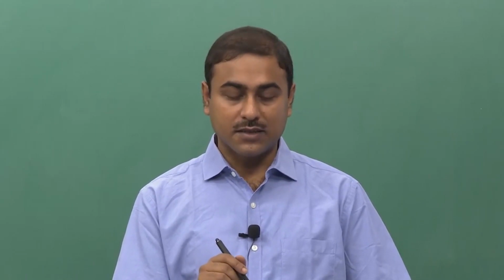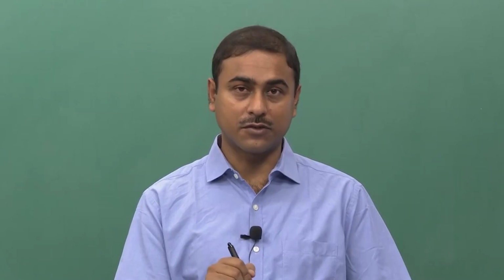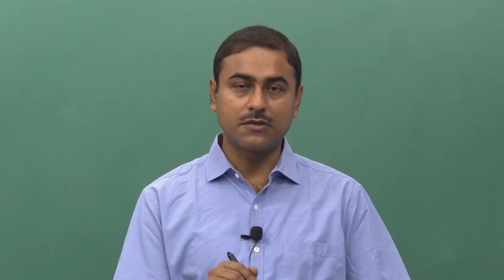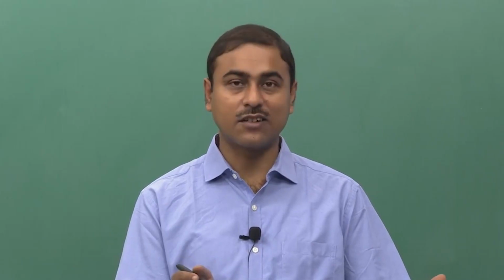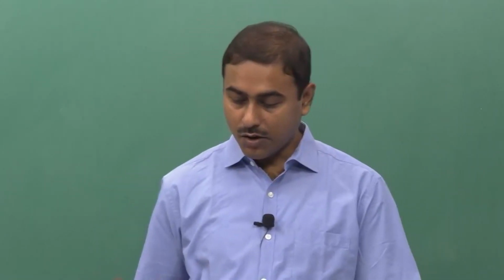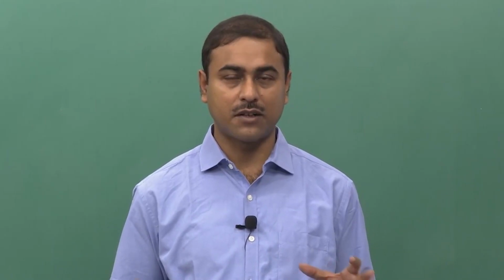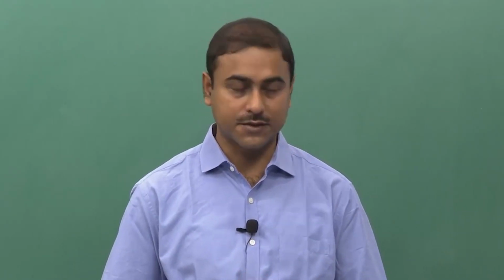Another thing is that you may ask, what if I am the first person to measure the fluorescence quantum yield, that means no reference is known? That is also possible, and we usually use the integrating sphere for this measurement, which I decided not to discuss in this case because of the time constraint, but it is possible. You can check in the literature later on. But this comparative method of the measurement of fluorescence quantum yield is well accepted all over the world, and people are every day using this method. So, this is good enough for this basic course.